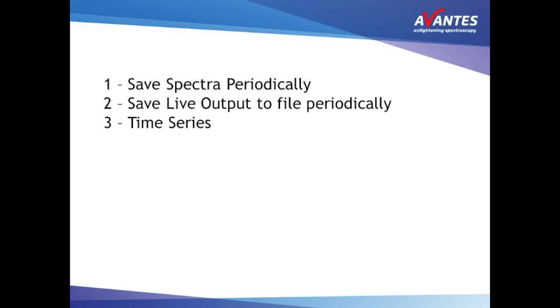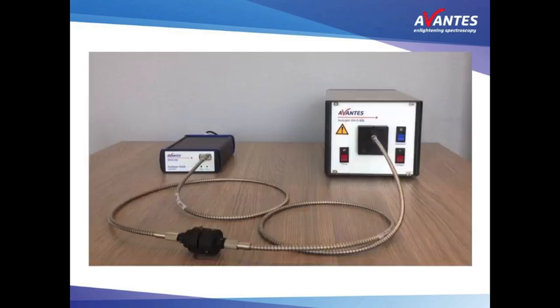This video will describe the save live output to file periodically. Save live output to file works similar to save spectra periodically, explained in another tutorial video. Advantage of this option is that also transmission, reflection or irradiance data can be stored periodically.